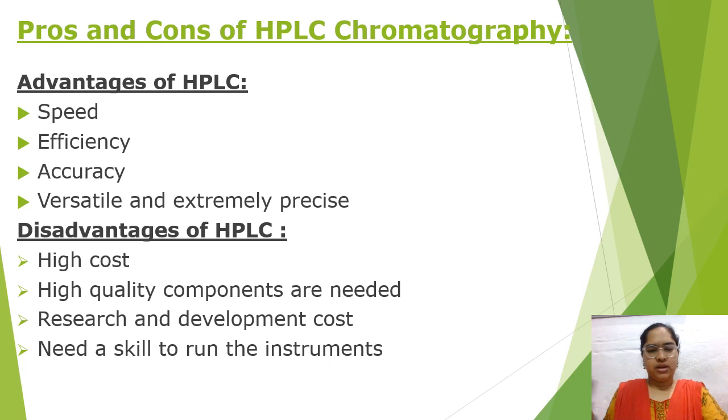Now look at the disadvantages. High cost, high quality components are needed. Research and development cost, need a skill to run the instrument. So it is very costly and only quality components can be used, and research and development cost is also very high, and to perform the experiment the person should have a minimum basic skill to run the instruments. So these are the advantages and disadvantages of HPLC.